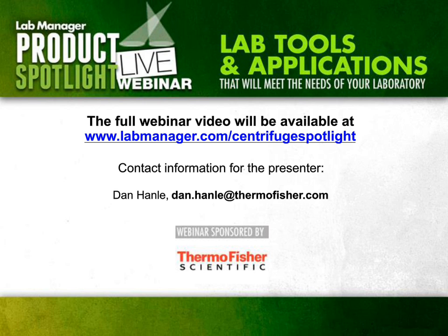There's typically an O-ring in there. And so often when I'm going around the labs, I probably at first don't even realize what I'm doing. I'm just looking at their hardware. But one of the first things I spy, if I can, is the status of the O-ring. Because if it's not properly greased, not only will it not do its job, but it tends to start cracking and breaking up. I know everyone's probably seen this if they've been around the lab. And that O-ring's not doing its job anymore, so it's a false security.